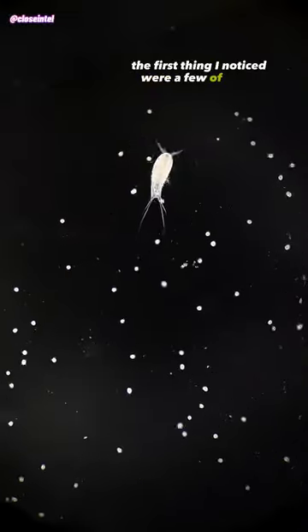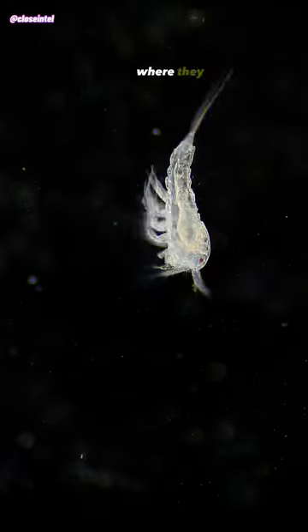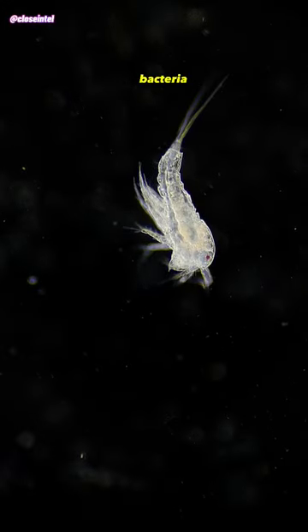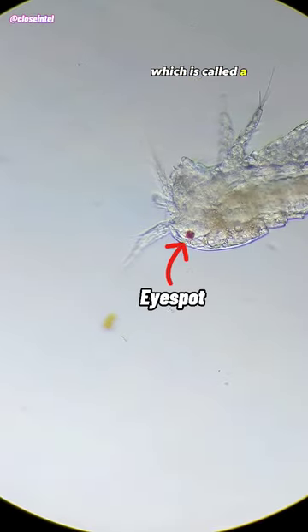The first thing I noticed were a few of these copepods, which are small crustaceans that can be found in both freshwater and saltwater, where they primarily feed on algae, bacteria, and detritus. You can see its single red eye spot here, which is called a nauplius eye.